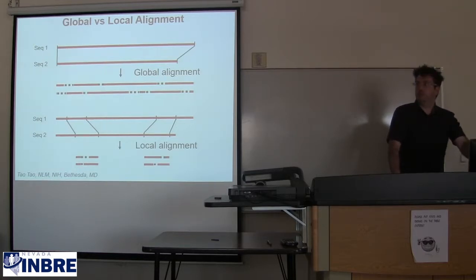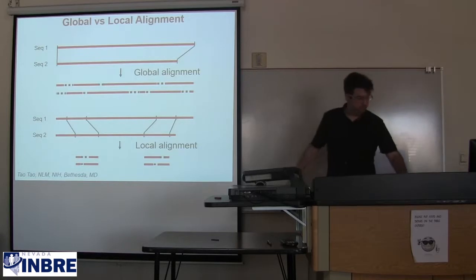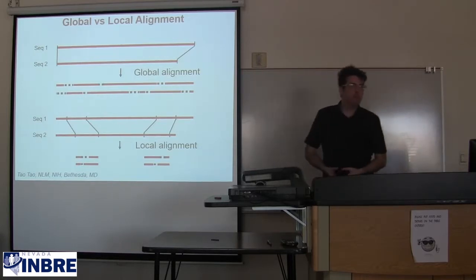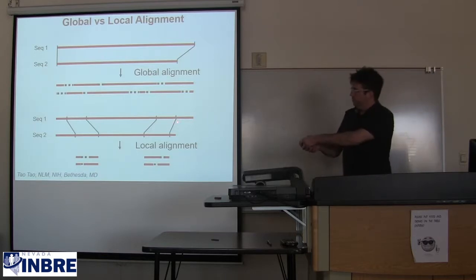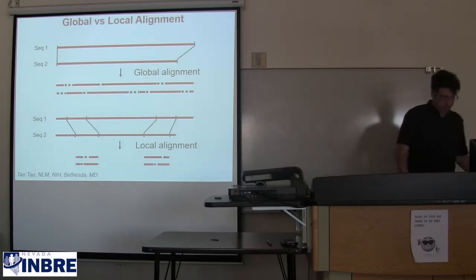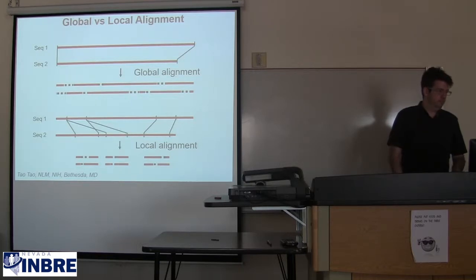And so if you have a lot of parts in the middle that don't correspond at all, it won't destroy the findings of these subregions here and here. If these are sufficiently similar, it really doesn't matter what's in here or if this space exists on both sequences even.